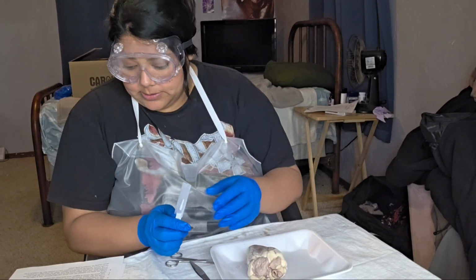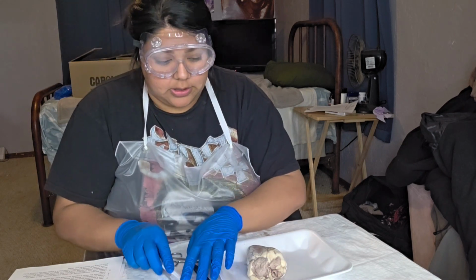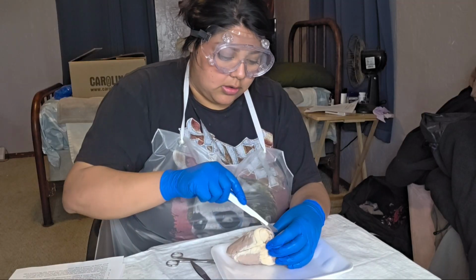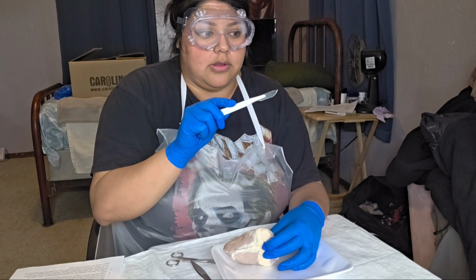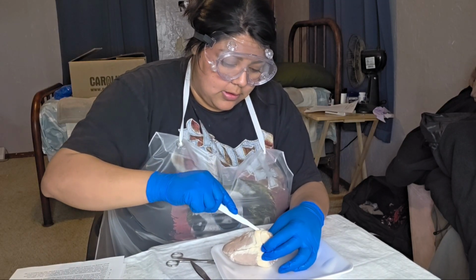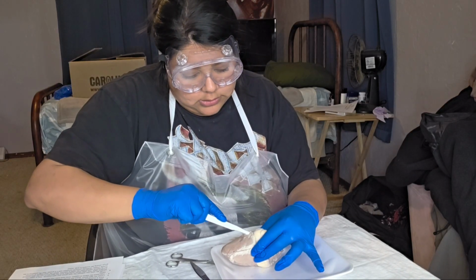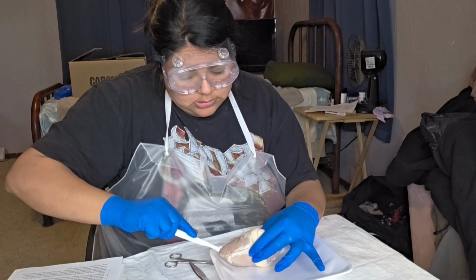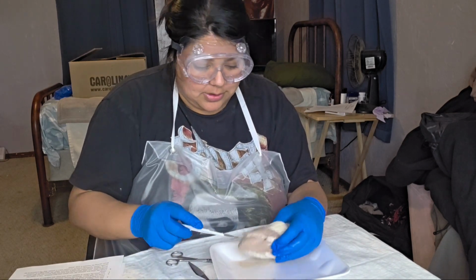So use scissors to cut through the side. I think the scalpel would be a better fit, so use it to cut through the side of the pulmonary artery, on the right side. We're just going to make a slice down, careful not to go too deep, down to the apex. So now let's cut through the right ventricle.